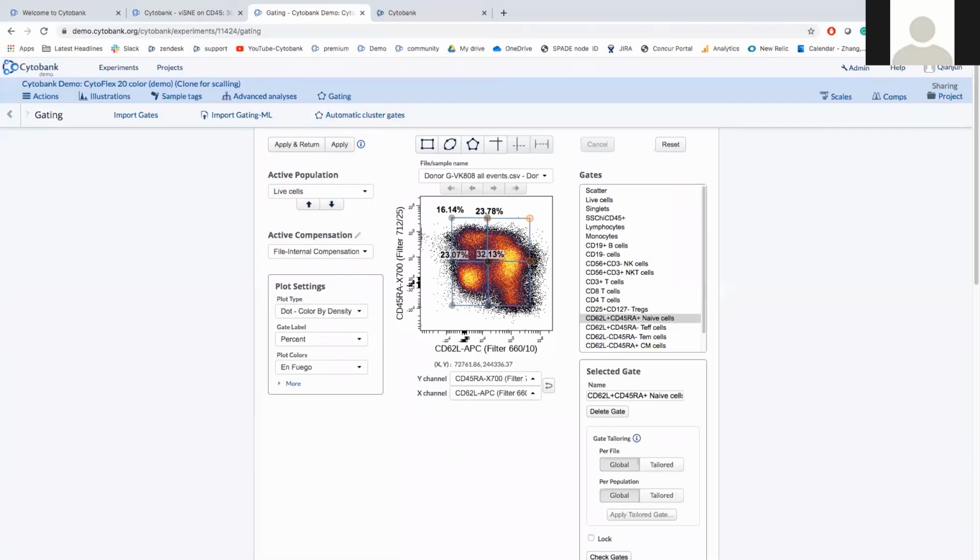So I have a question with regard to data from different instrument types. Cytobank can take any FCS file as long as it's in the standard FCS format. And also, we take pretty much all instruments. I know some of the cytometers out there have different ranges of the fluorescence channels.